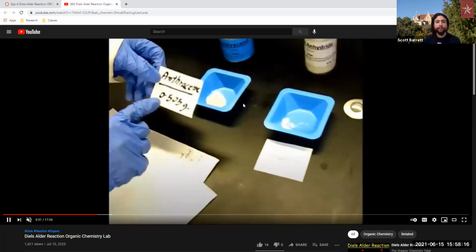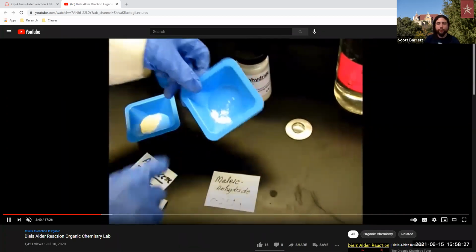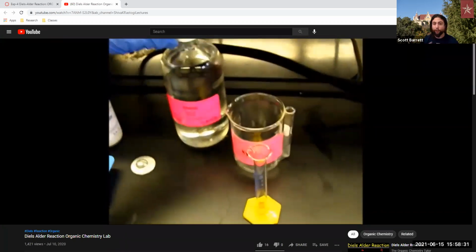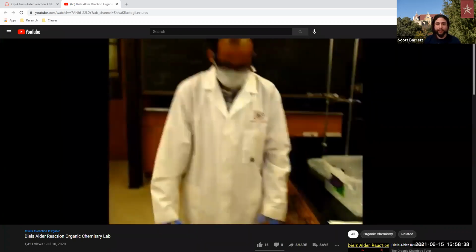So in your section on the hazards, remember, we need to add every chemical we're utilizing. So anthracene, this is organic, and maleic anhydride alone would be considered aqueous or organic. I'm not too picky on that one. Just make sure in your hazards that you have all of them listed. Xylene is organic. There is no question about it. It is purely an organic solvent.